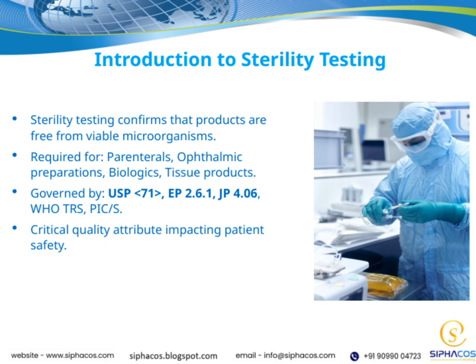These types of products require strict sterility assurance because they are often administered directly into the body or come into contact with vulnerable tissues. The standards and guidelines governing sterility testing are set by various authorities, including the USP, EP, JP, WHO, and PIC/S. Each of these organizations provides specific protocols to ensure consistency and reliability in testing.